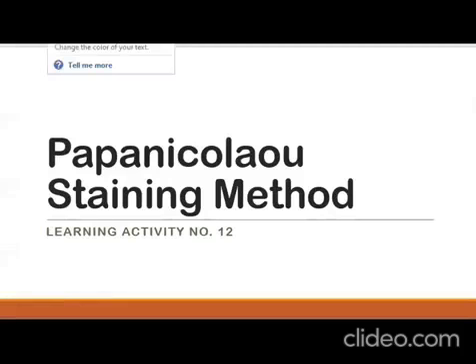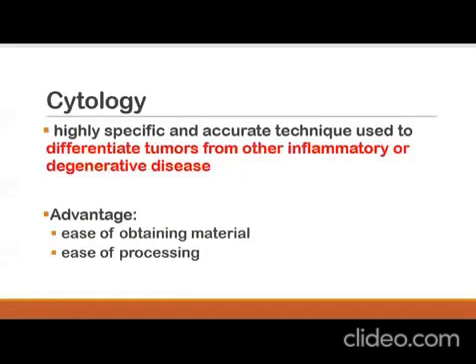Okay, so hello. I'm going to discuss today activity number 12. It will focus on the Papanicolaou staining method. So, the staining method is actually considered to be a method of choice under cytology.